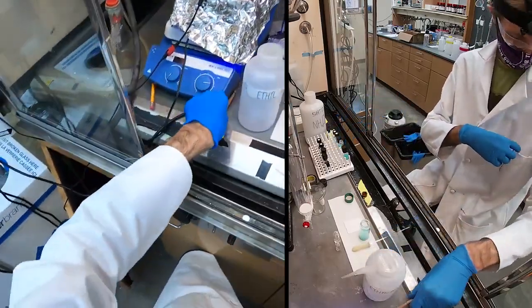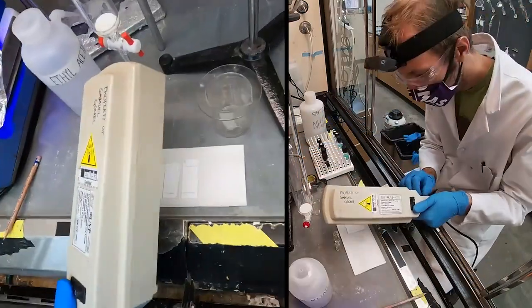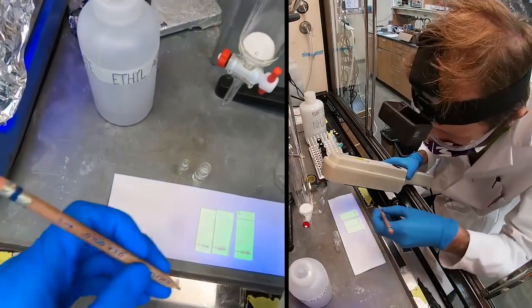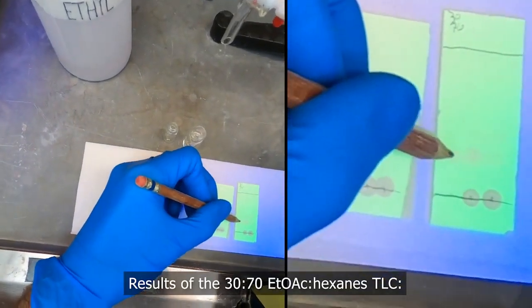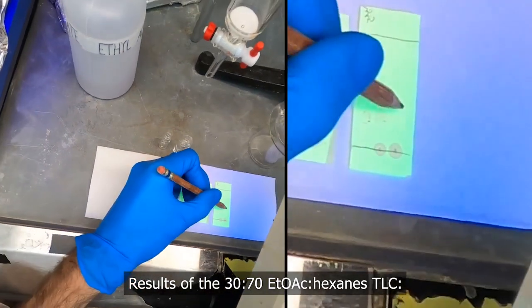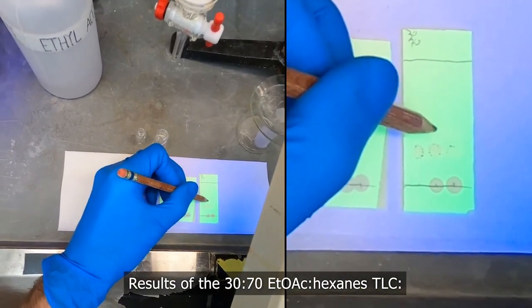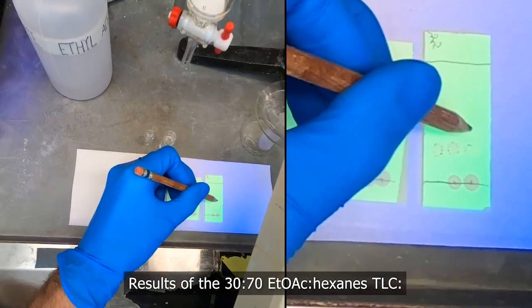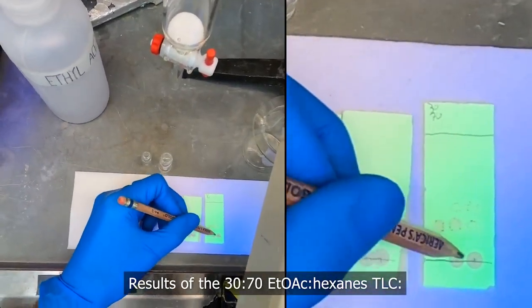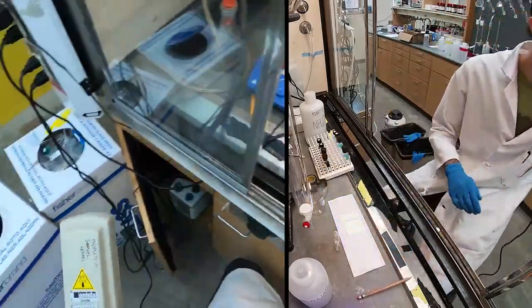So this TLC plate is just about done. Okay, so we have our starting material right here. Looks like we have some starting material left over in the reaction. We do have a new spot that's coming up above the starting material. And of course we've got our baseline. And there isn't really much above that.